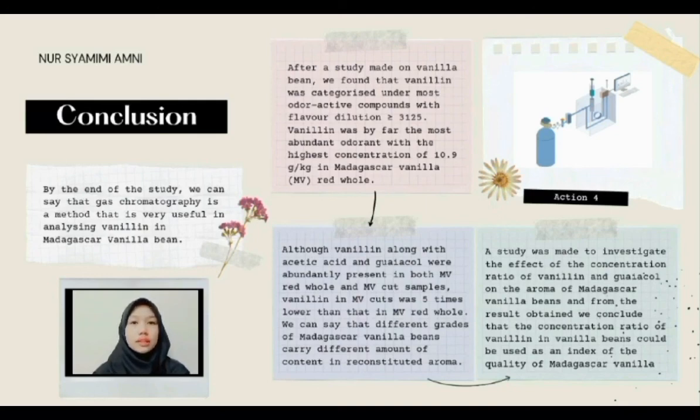A study was made to investigate the effect of concentration ratio of vanillin and guaiacol on the aroma of Madagascar vanilla beans. And from the result obtained, we conclude that the concentration ratio of vanillin in vanilla bean could be used as an index of the quality of Madagascar vanilla.